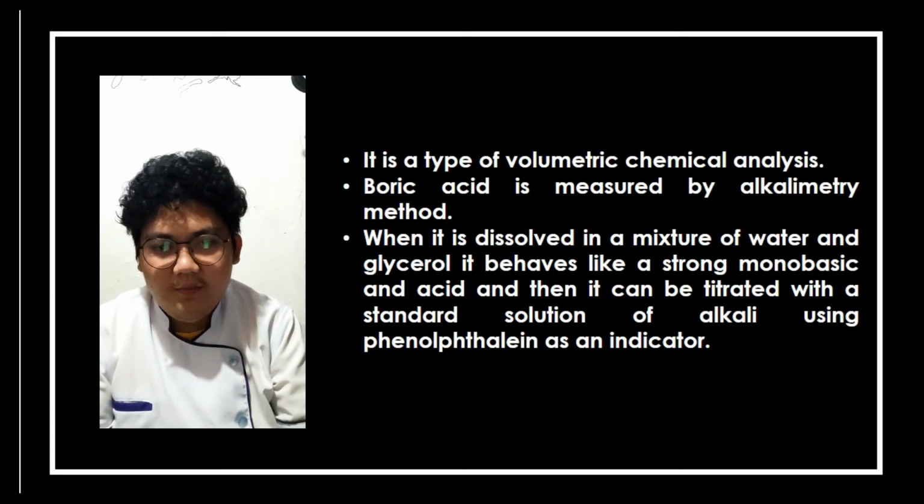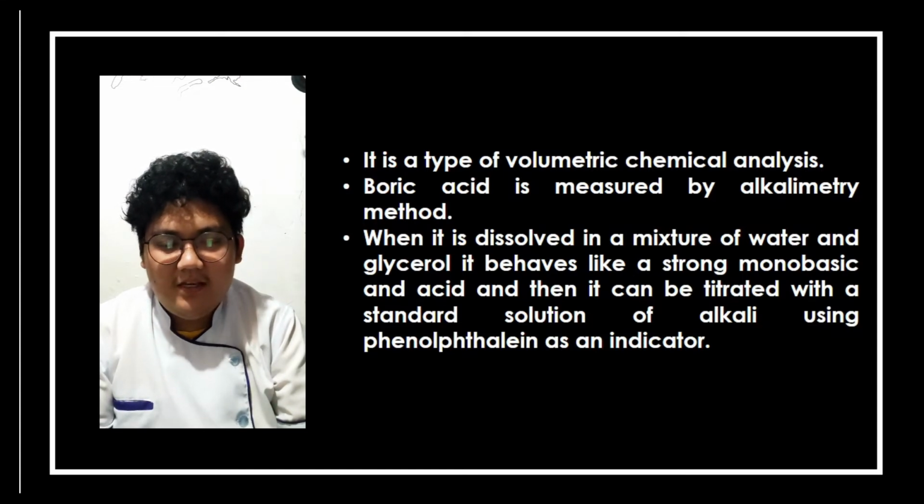When it is dissolved in a mixture of water and glycerol, it behaves like a strong monobasic acid, and then it can be titrated with a standard solution of alkali using phenolphthalein as an indicator.